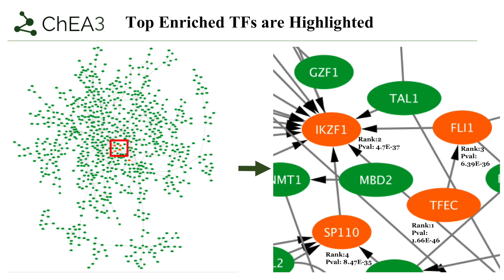Here we can see the CHIA-3 web application interactive visualization of the transcription factor regulatory network. The top enriched transcription factors from the GTEx library are highlighted. A closer look into this network shows clustering of the top four enriched transcription factors: IKZF1, FLI1, and SP110, which were also in the top 10 results of the integrated library. IKZF1 is associated with poor survival in ovarian cancer, overexpression of FLI1 triggers abnormal cell proliferation, and SP110 is seen to regulate genes involved in apoptosis.